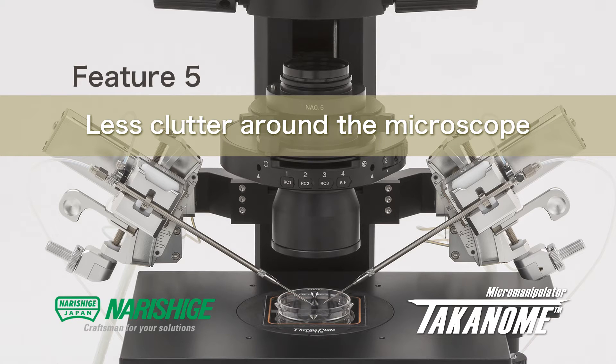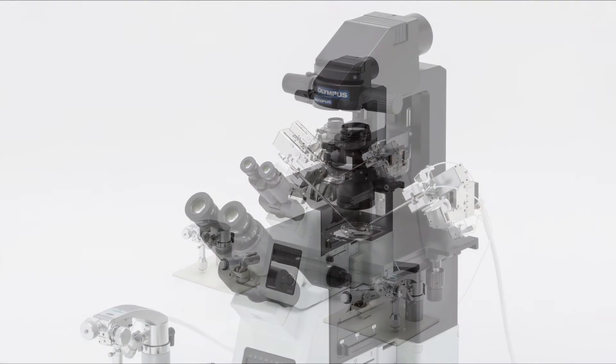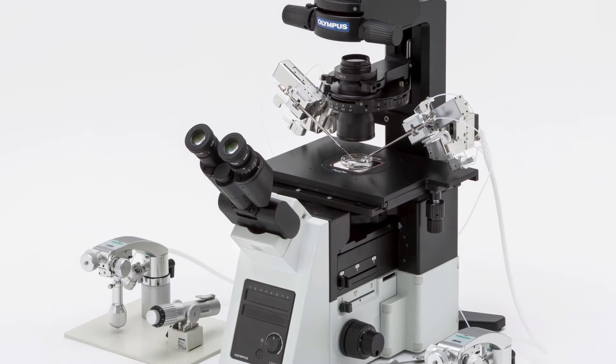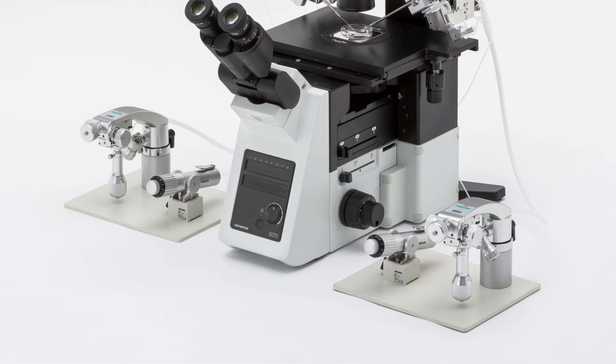Feature 5: simple motorless microscope operation. No power supply is required, so the area around the microscope is uncluttered. A single slit tube bundles together the oil hydraulic tube.